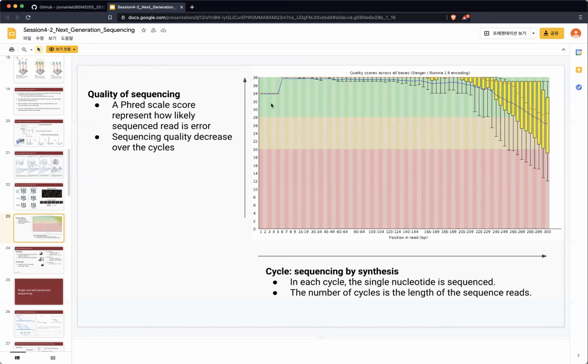Each cycle takes like 30 or 40 minutes, so after a few cycles, it would probably pass a few hours. Then after a few hours, the enzymes get degraded and become less accurate, so it will introduce errors. So the sequencing has quality ranging from 20 to 30 something, right? So cycles are a problem in Illumina sequencing. That's why the quality goes down.